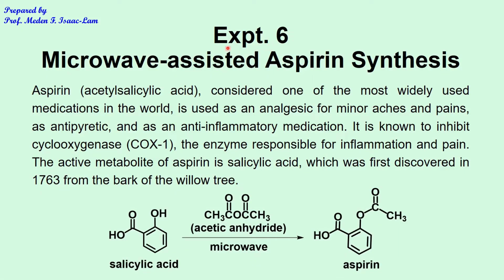Experiment 6 is about microwave-assisted aspirin synthesis. Aspirin, or acetylsalicylic acid, considered one of the most widely used medications in the world, is used as an analgesic for minor aches and pains, as an antipyretic, and as an anti-inflammatory medication. It is known to inhibit cyclooxygenase, or COX-1, the enzyme responsible for inflammation and pain.